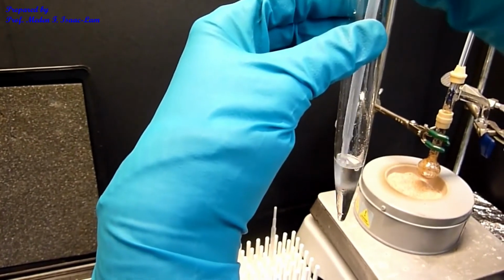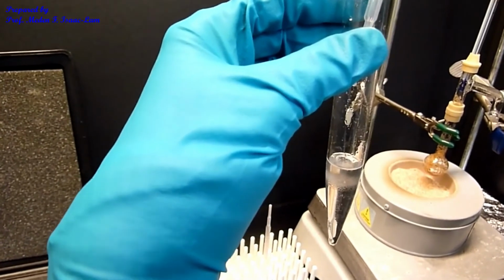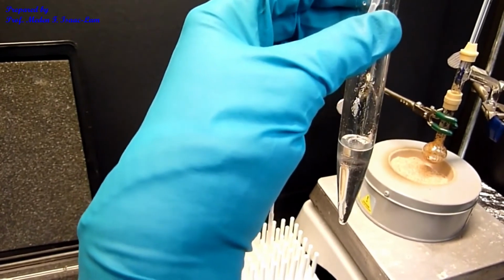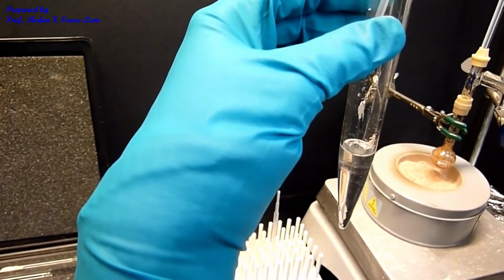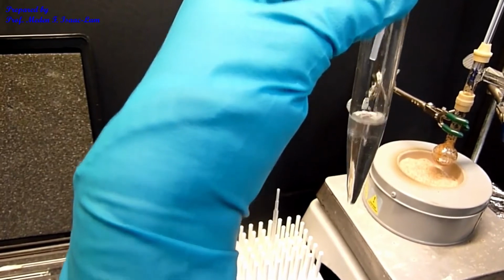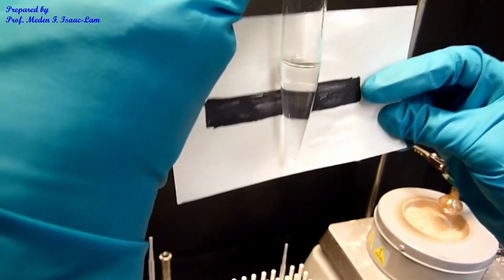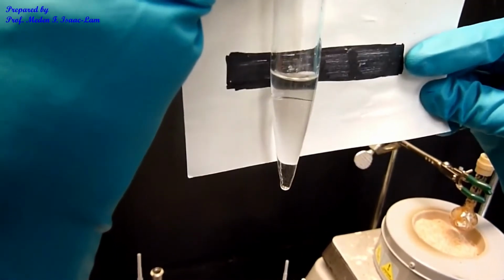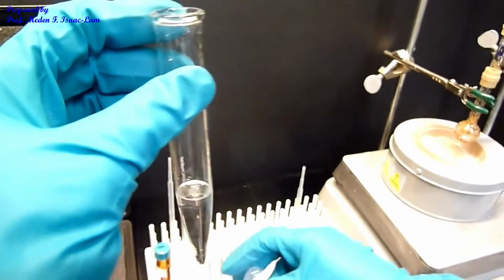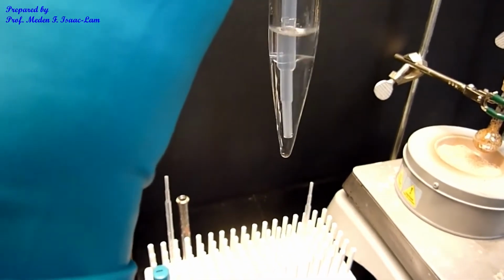Now you have 2 layers, an organic layer and a lower layer. Because the density of the ester is less than the density of water, because I added aqueous sodium bicarb, my ester is going to be the top layer. You can see there's a layer. Okay. So the top layer is going to be my ester. So I can take out the bottom one by using the pipette.